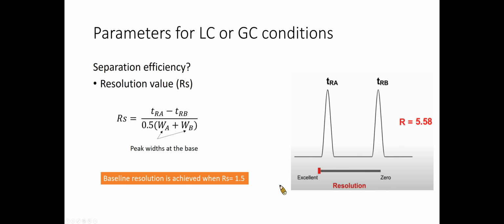As mentioned in our previous lecture, scanning too many MRM channels in the same time segment would decrease the instrument's duty cycle for each channel, which in turn reduces the analytical sensitivity. Successful chromatography separation would enable one segment for one analyte, which would therefore increase the duty cycle and sensitivity as few ions are wasted. So how do we know the separation efficiency between two peaks?